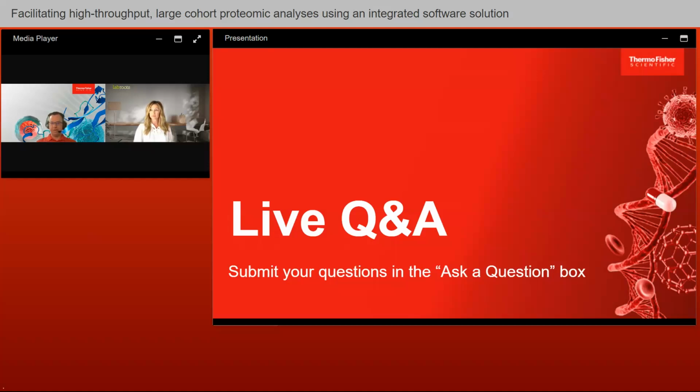We will not put numbers in the Data Explorer associated with the PD result file if there is not some sort of control of confidence. We don't want to put results into the Data Explorer for you to peruse without having some sort of FDR control. So you don't get 30,000 proteins and some enormous uncontrolled number of PSMs and peptides, but instead we will only put high confidence results into the list there.